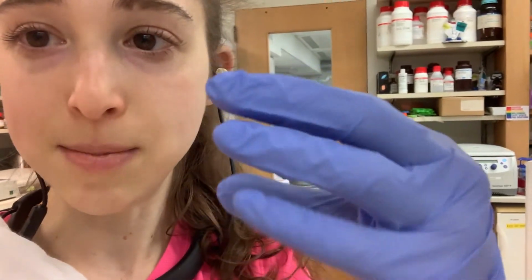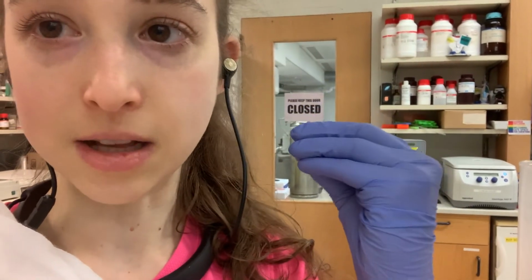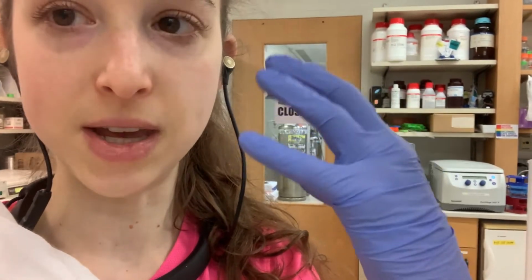And so the more heat you add, the more likely that is to happen. So if you were to cool that down, now your deprotonation is going to be slower to a lesser extent, and you're going to have a more basic solution, so a higher pH at a lower temperature. And so it's important, especially if the pH is sensitive, that you make sure the pH is where you want it at the temperature where you want it.